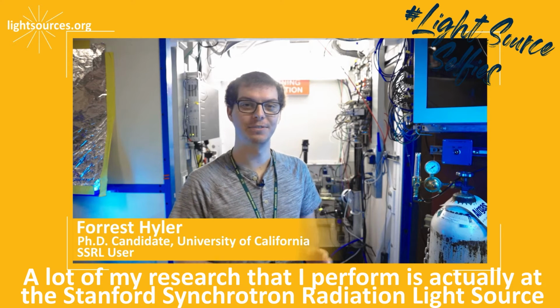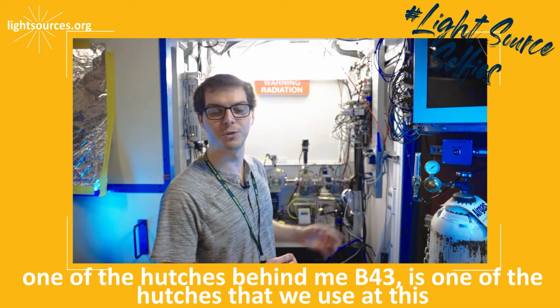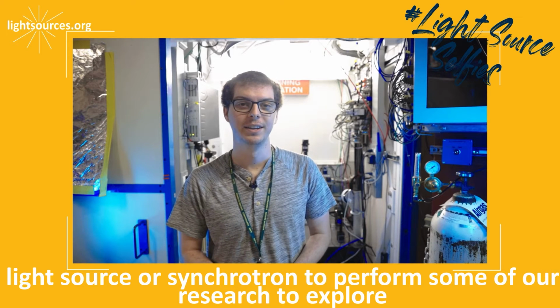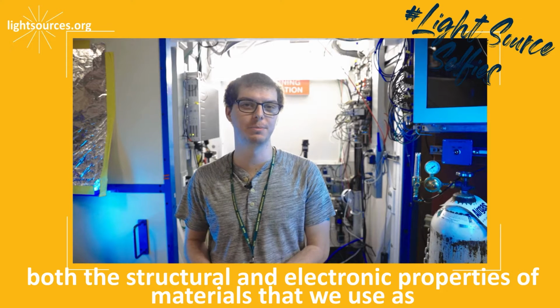A lot of my research is actually performed at the Stanford Synchrotron Radiation Lightsource. One of the hutches behind me, 4-3, is one of the hutches that we use at this light source, or the synchrotron, to explore both the structural and electronic properties of materials that we use as catalysts for carbon dioxide reduction in our lab.